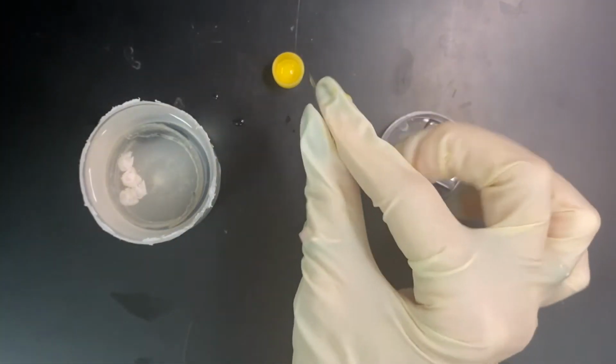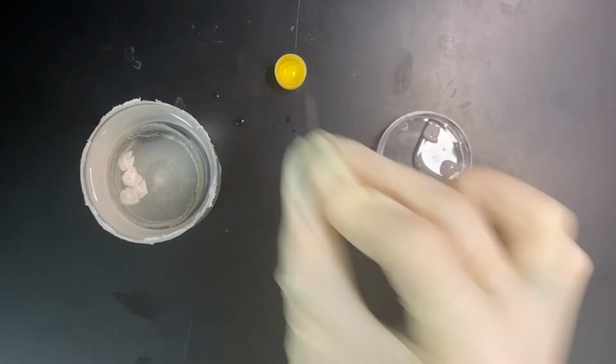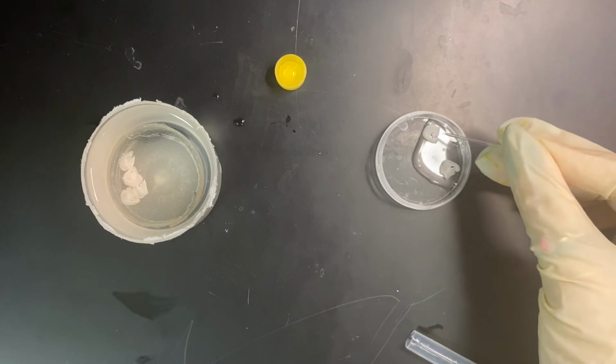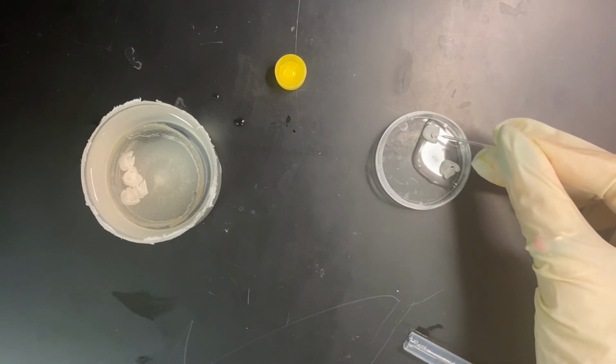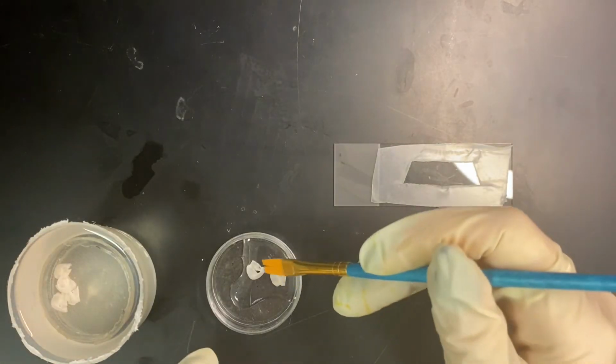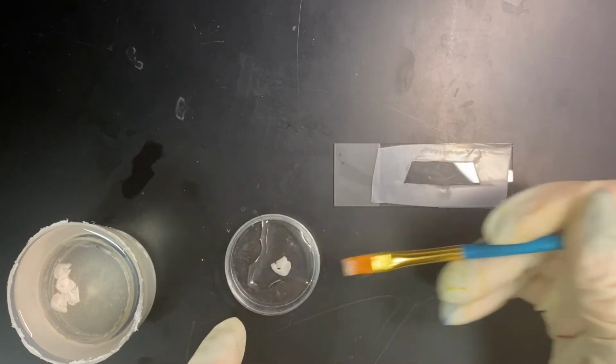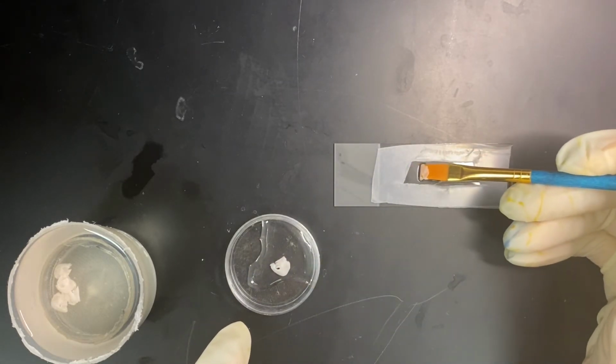I also decided to use a glass micropipette to apply the DiI in hopes that it would be more accurate than a flimsy plastic pipette. All in all, this round should turn out a lot nicer and take just a fraction of the time. I wanted to get a minimum time required in the books, so I let the slices sit for only about 6 hours and then mounted them for visualization under the microscope.